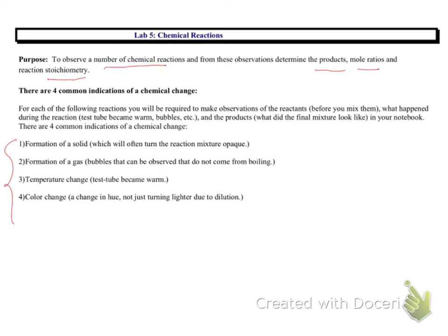But to observe these changes, you have to make sure that first you observe the reactants before mixing them, and then observe what's happened during the reaction, and then look at your final mixture, which is your product as well.